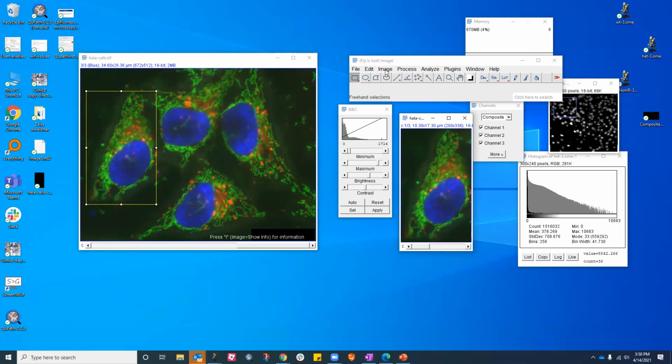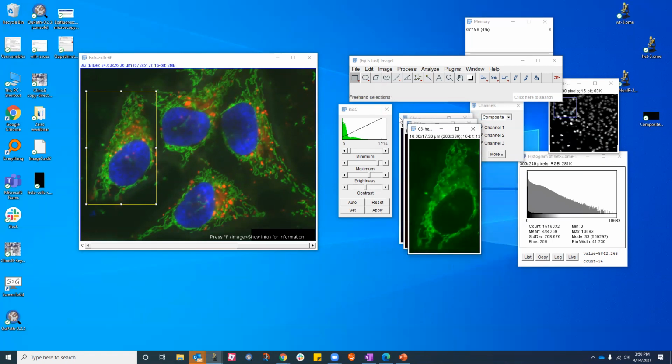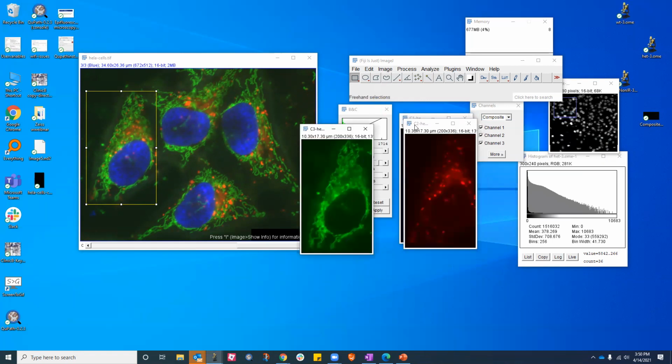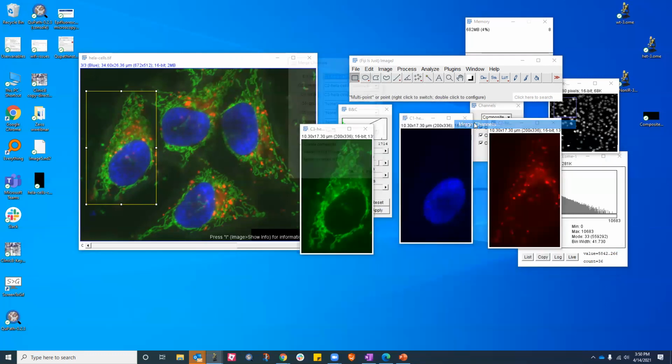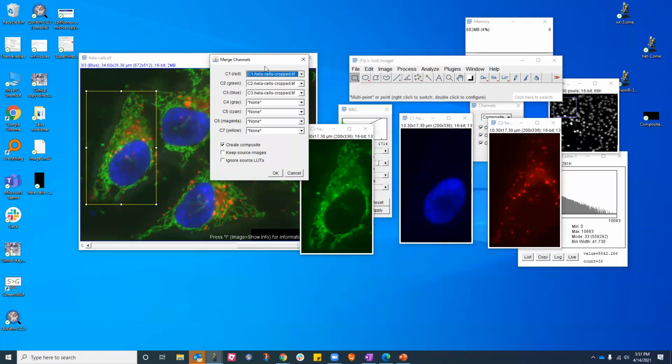So let's do this again, all right? Image, color, split channels. I split them up. Let's go here. Image, color, merge them. So let's say if I make this channel 3, channel 2, channel 1, all right?